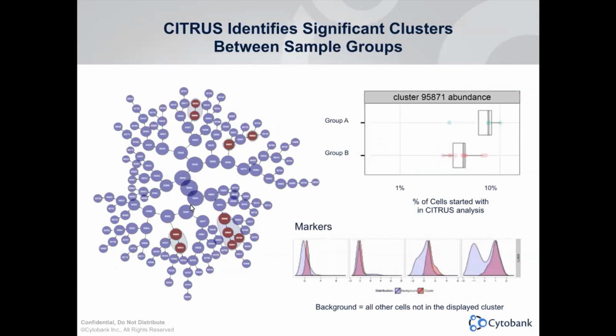You probably can't see it, but there are arrows between the clusters pointing from parents to children. If the connected clusters are identified as significant, as highlighted here, you can probably just pick the parent cluster, as it contains all the child clusters, unless you want to identify the subsets in more detail.